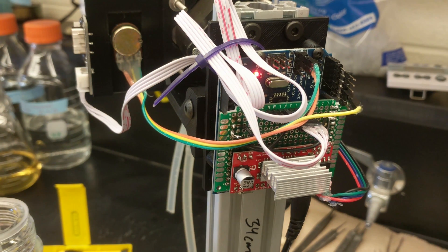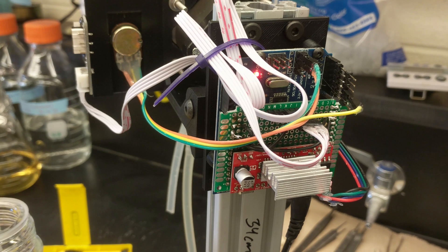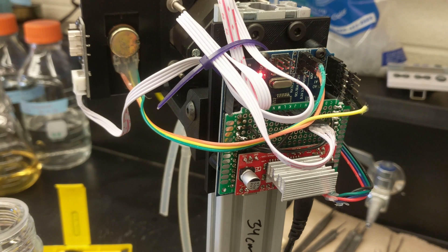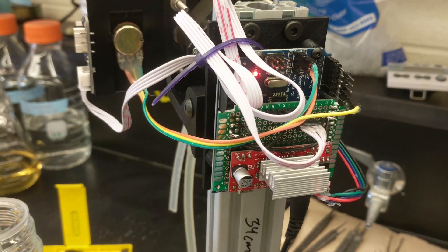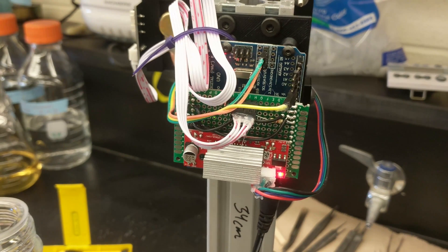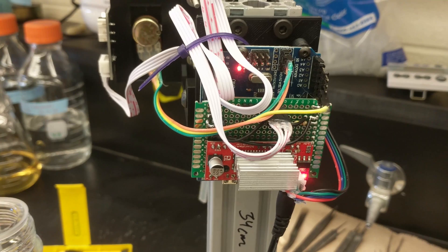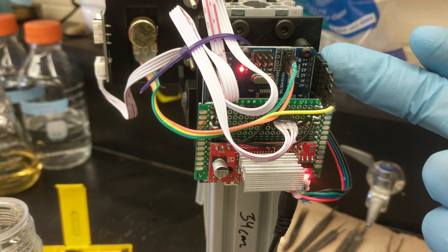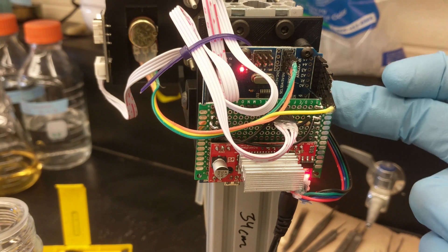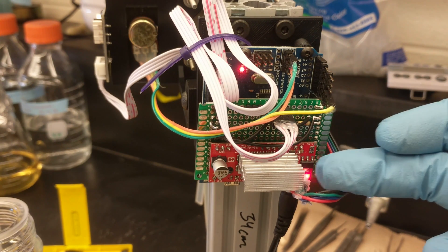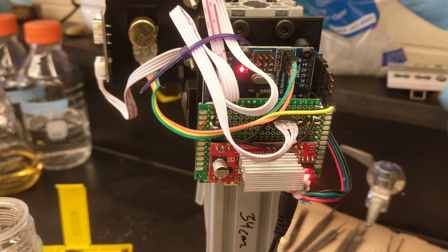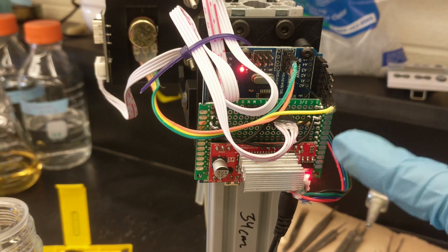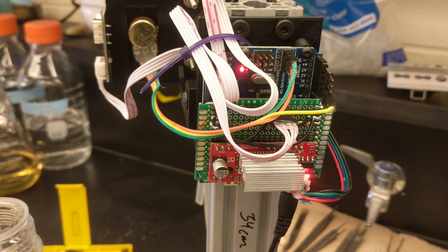I'll be putting up a plan and a breakdown of all these parts on the blog. It looks a little messy right now but it's really not that complicated. There's really only a few components: there's the brains which is the Arduino board, you have the stepper motor driver which actually moves the motor, and then there's a switch and a potentiometer on the front which I'll show you right now.